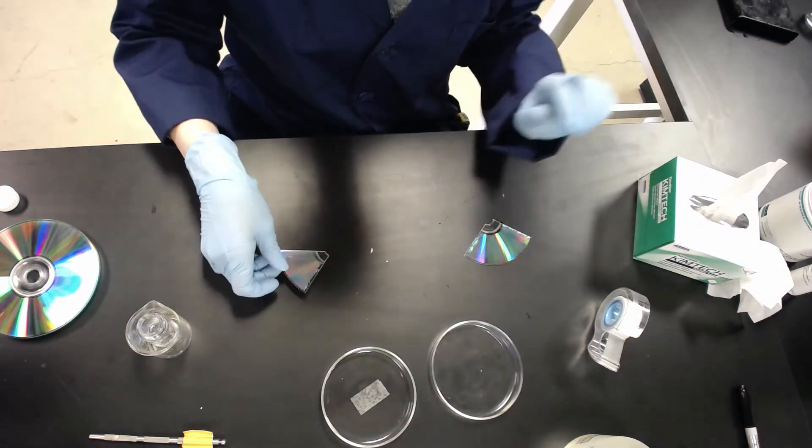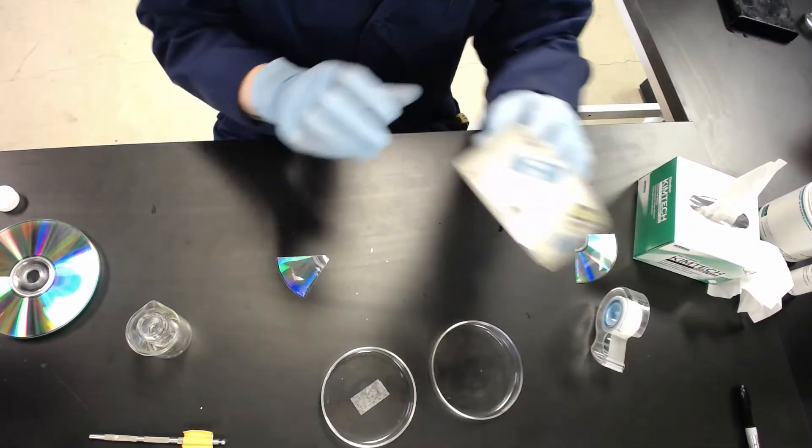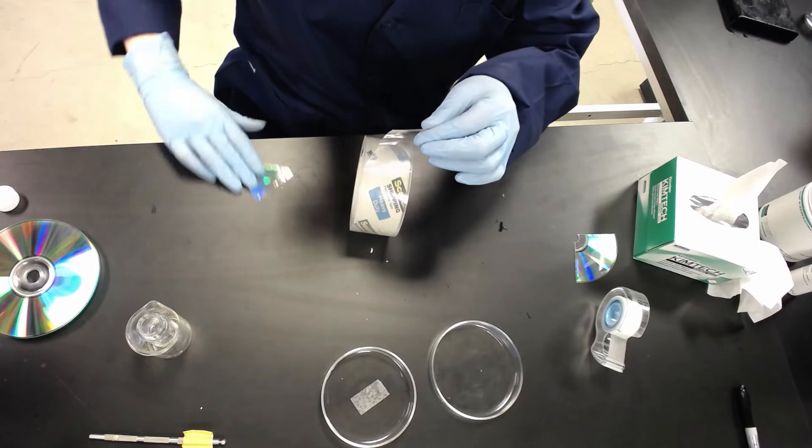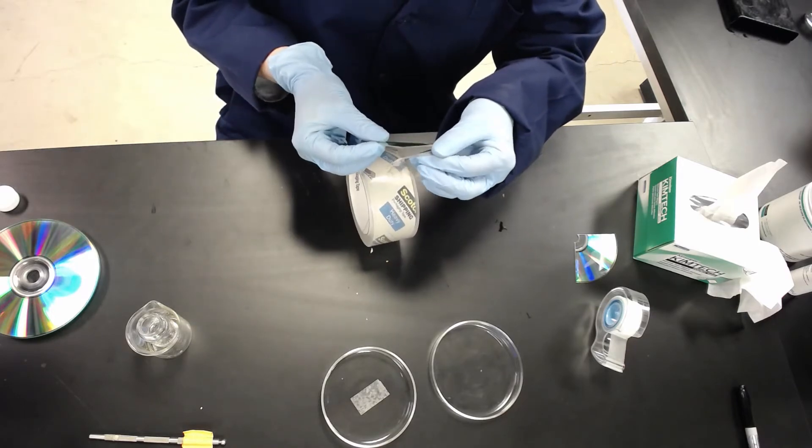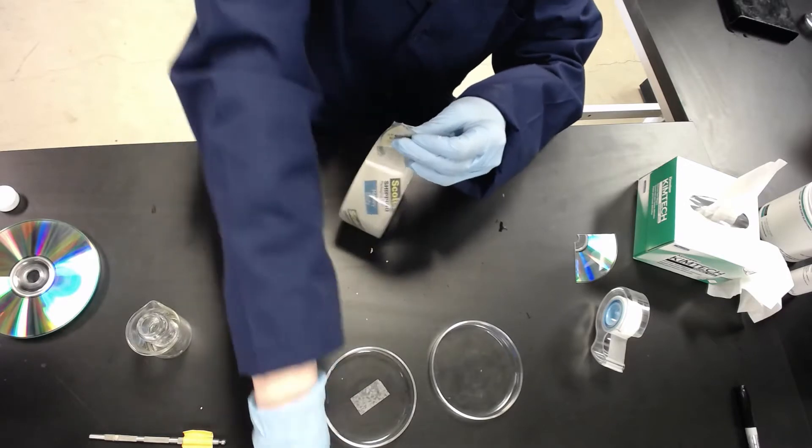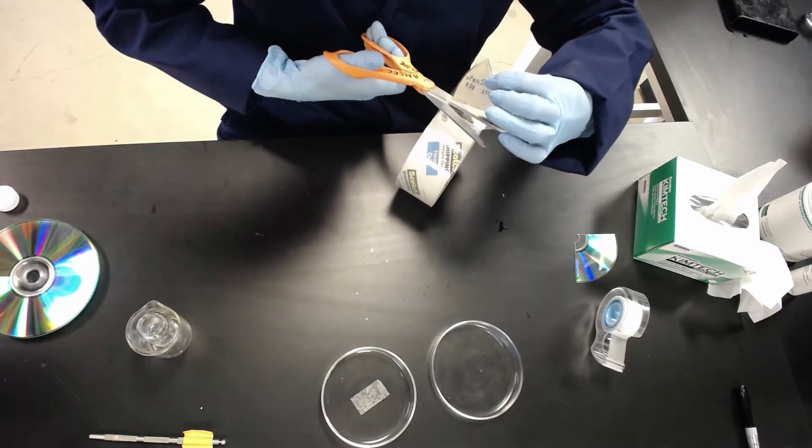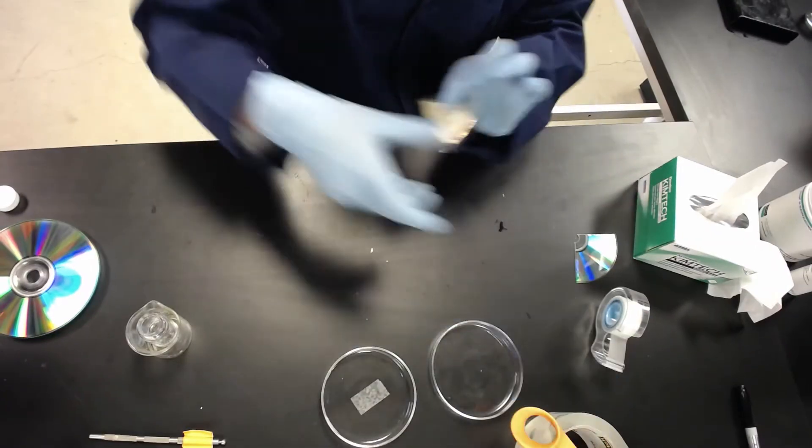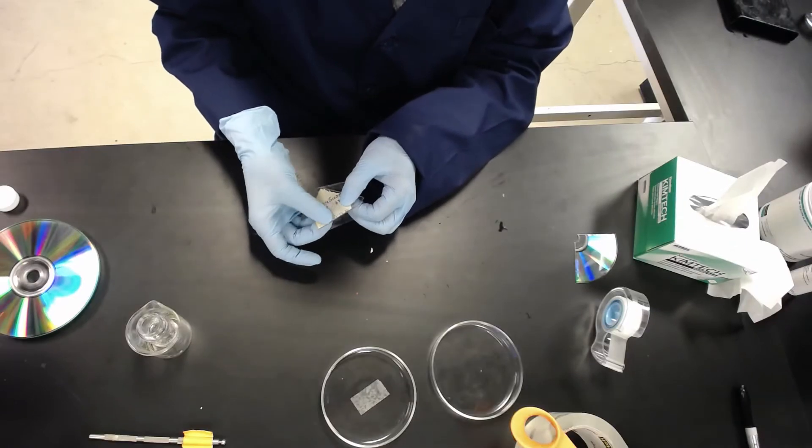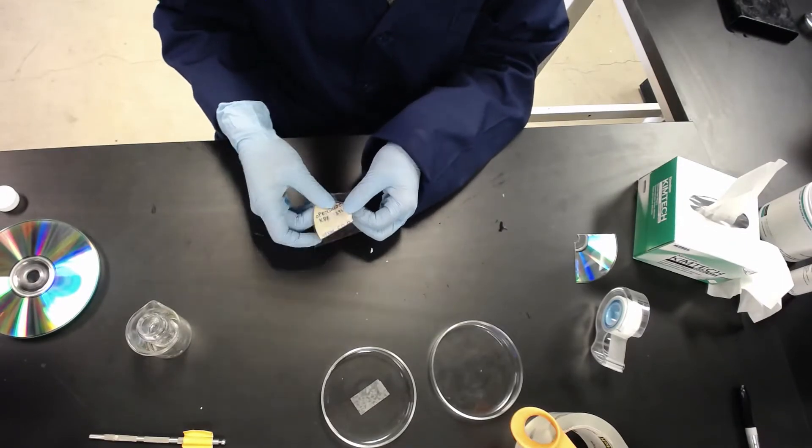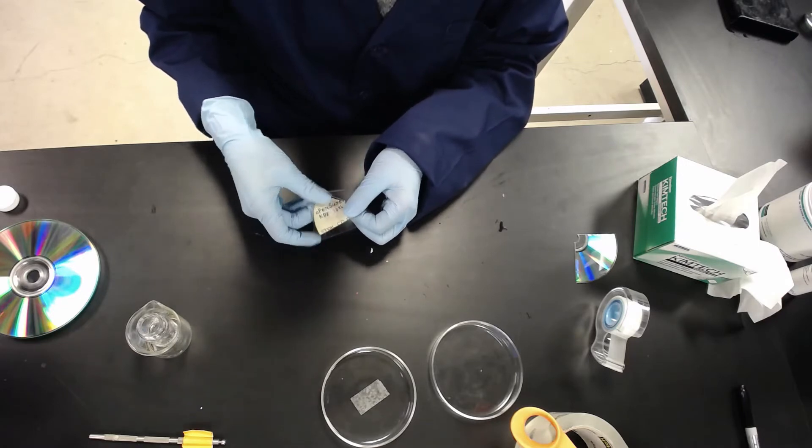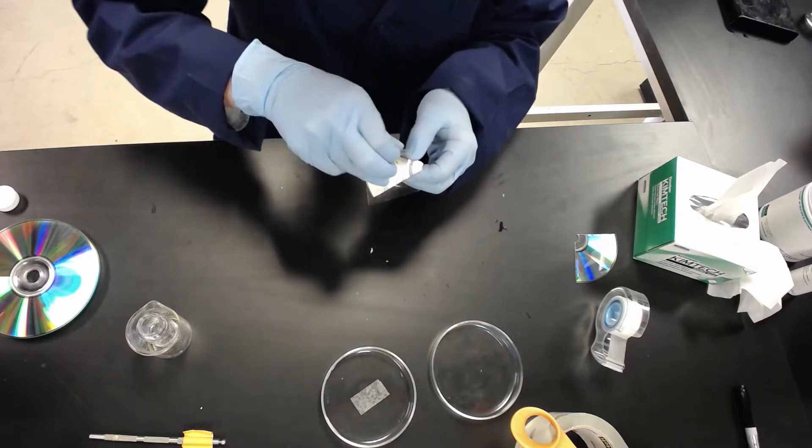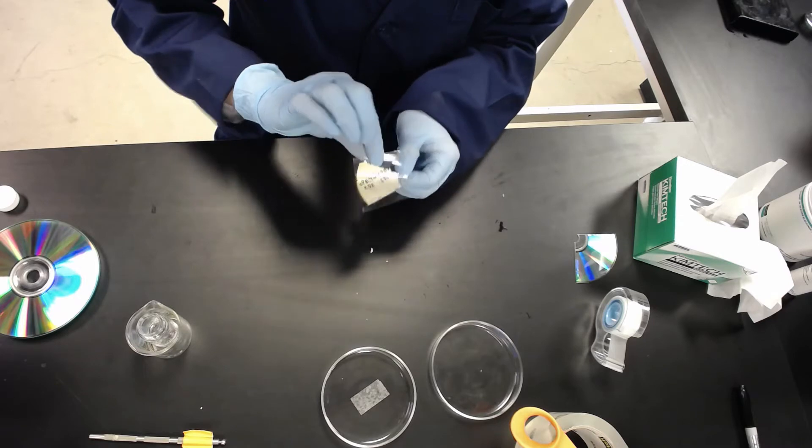So now we're going to remove the aluminum with some tape. I'm putting tape side down—obviously that's how tape works—and now I'm going to peel off, hopefully, the aluminum.